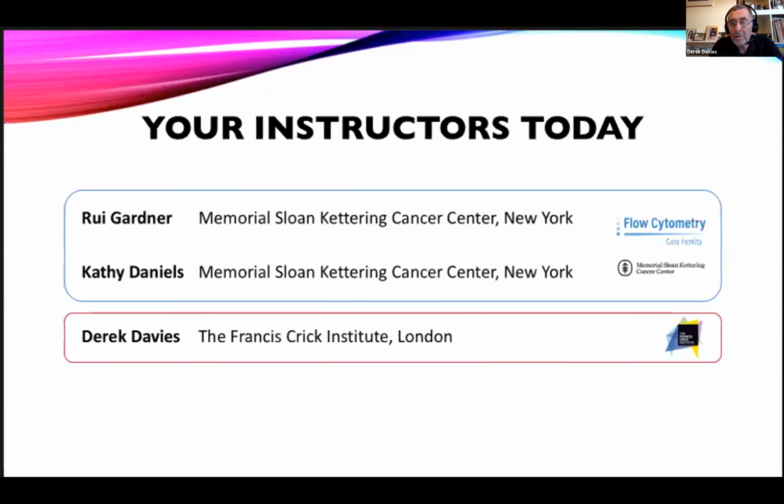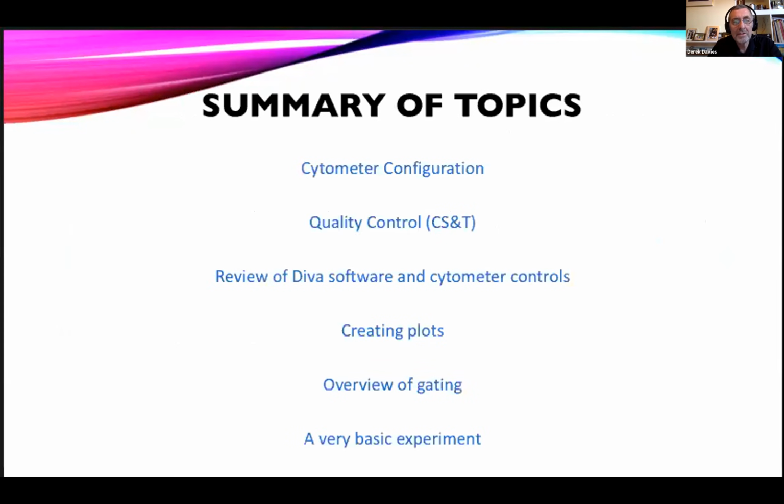I think both of our facilities are very good at training people to use the flow cytometers. As Rui said, this webinar is only going to be an hour, so we can't hope to teach you the whole of cytometry in that hour. We will be following up with a couple more webinars in the next months, with more details at the end. But today, we wanted to get the basic principles across, so that when we come to our next webinar, we'll be able to jump straight in and set up an experiment.